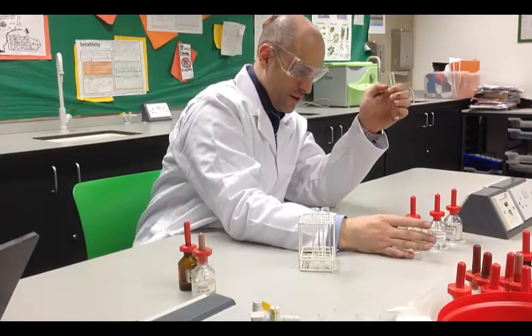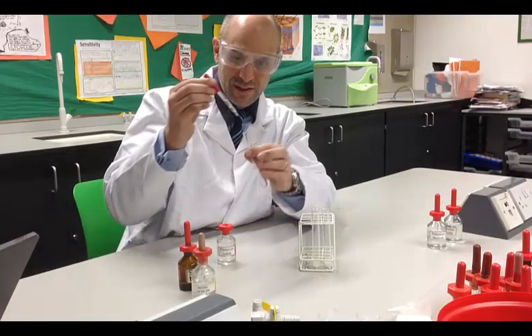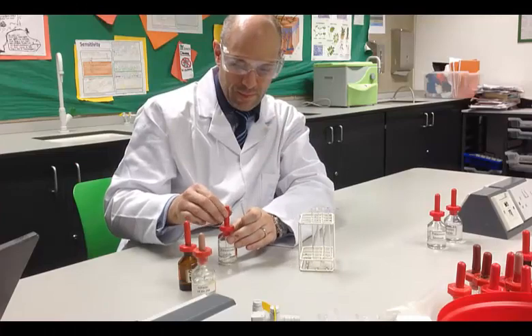Finally, the third ion we're going to test is the iodide ions, again with potassium iodide. A few squirts into a test tube.